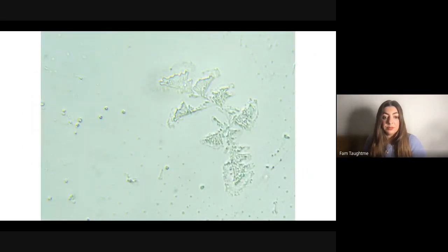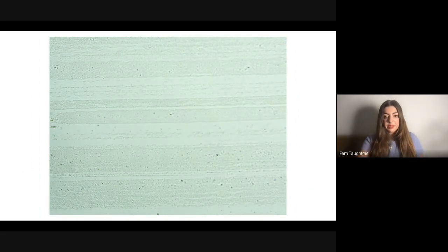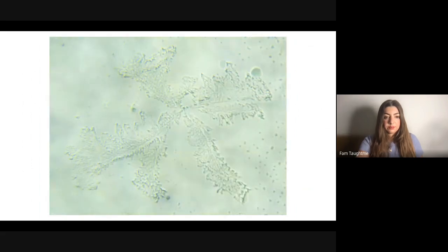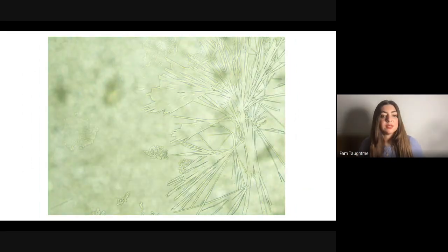And these were just some really cool ones. So I'm going to show you just a few fun and interesting slides of cool captures that I got over the course of the experiment. So yeah, there's just so much, there's like whole worlds inside of these captures. It was really, really amazing to see.